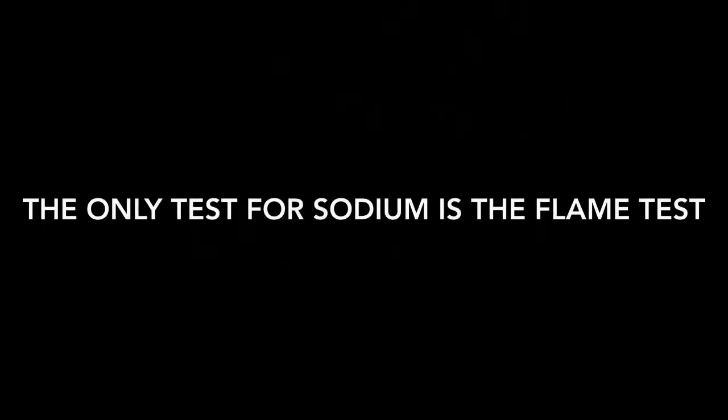Second question. A colorblind student has difficulty distinguishing between the sodium and calcium flame colors in the flame test. The unknown solution produced white solids when ammonium oxalate was added in the calcium ion test. Which is present, calcium or sodium? Well, it's positive for calcium because it tests positive in the calcium ion test.